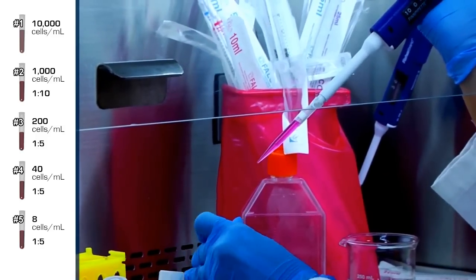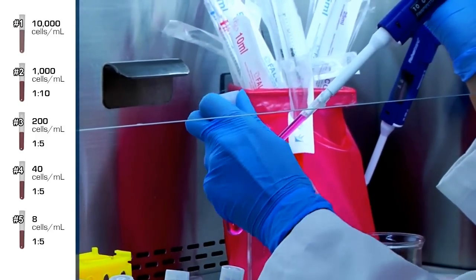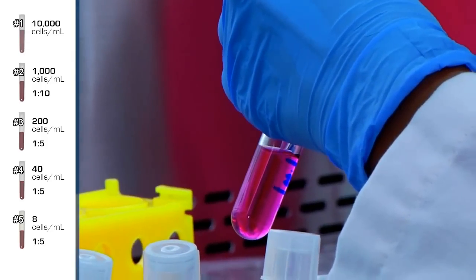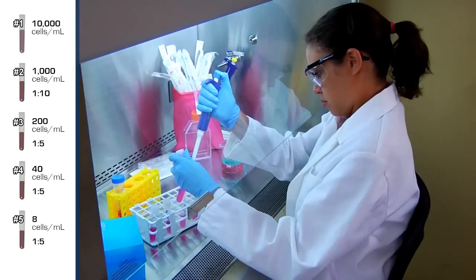Lastly, transfer 1 milliliter from tube number 4 to tube number 5 for a 1 to 5 dilution with a concentration of 8 cells per milliliter.